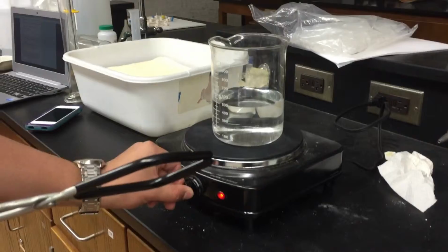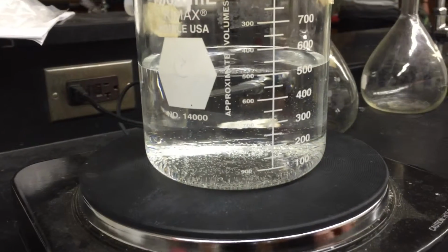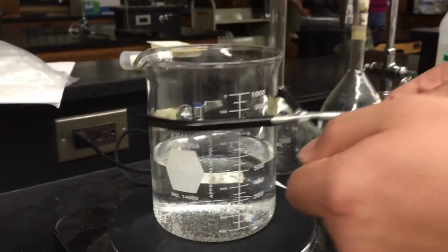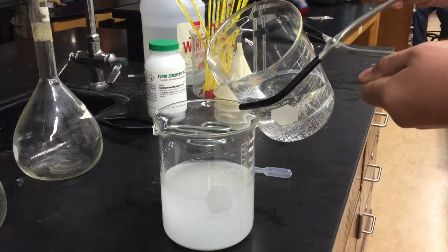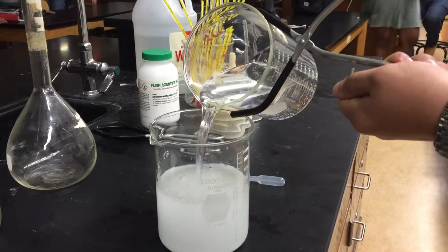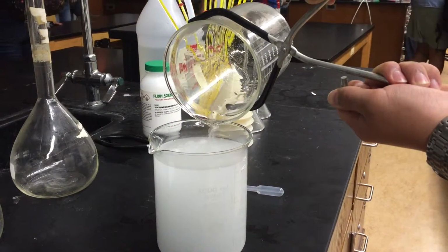Taking half a liter of water and placing it on a hot plate to increase its temperature in order for it to boil. Now this boiling water will be mixed with our previous half liter of water and starch in order to raise the solubility of the starch with a greater temperature. While dealing with hot glassware, always make sure to have proper equipment to not burn yourself.